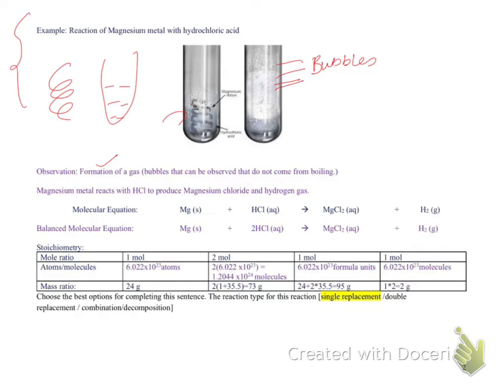And so you write that down under observation. Since you observed a change, that means a product is formed, and you write down a balanced chemical equation. It's not that whenever you mix two things, a reaction always takes place. No, it doesn't go that way. So you have to observe that there should be some indicators to show that the chemical reaction has taken place.